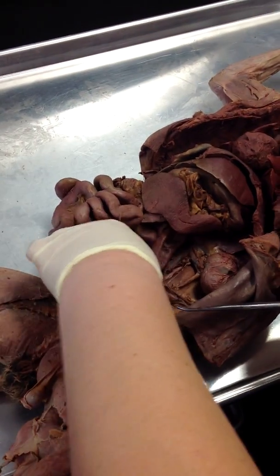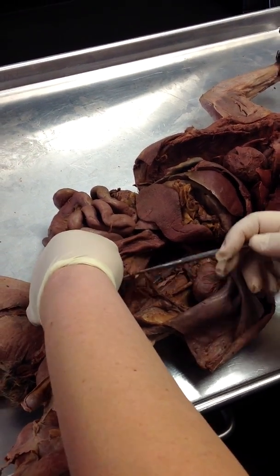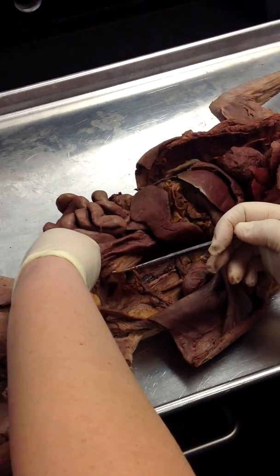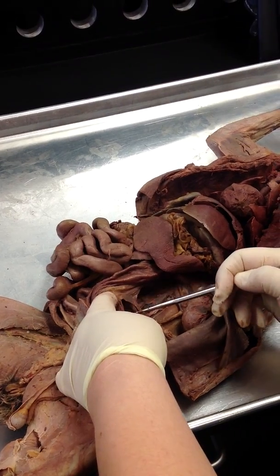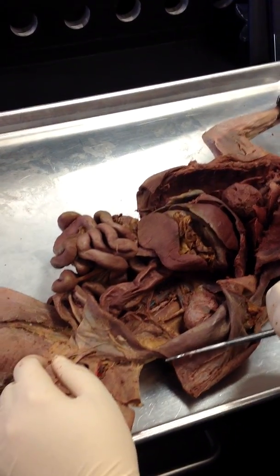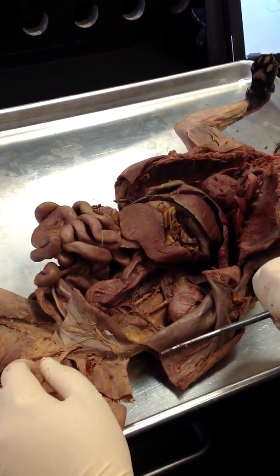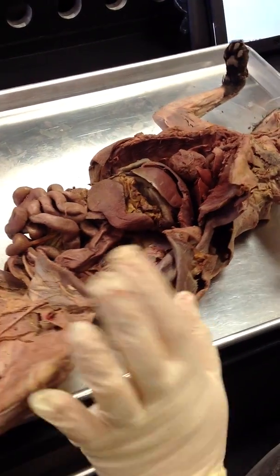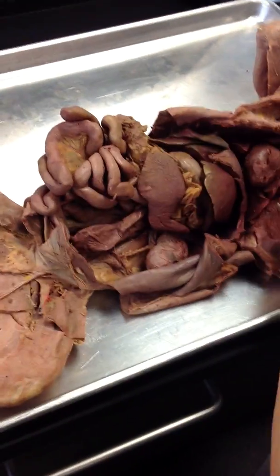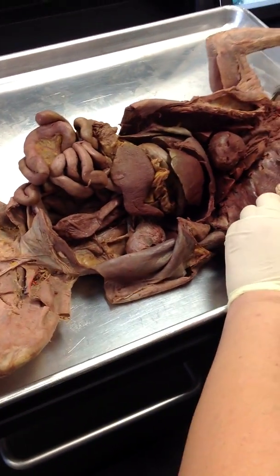And then the last artery is the inferior mesenteric, which is this. Okay? It's not very well injected, but you can feel it. You guys already... I did this cat as a demo, right? Yeah. Okay. I was going to say, this is very well dissected. Well, thank you. All right, so those are all the arteries.